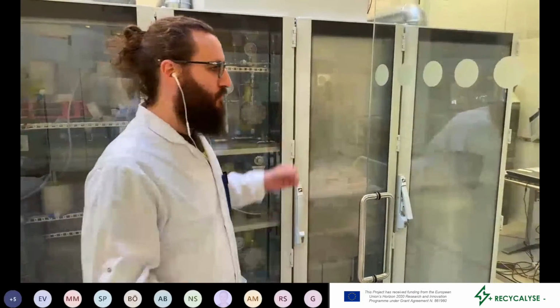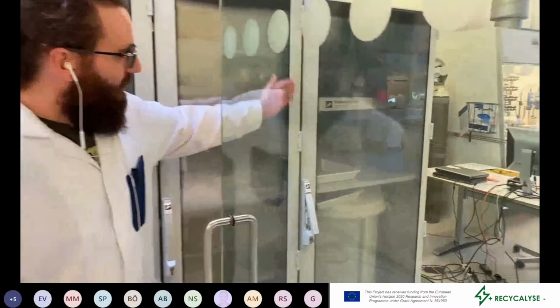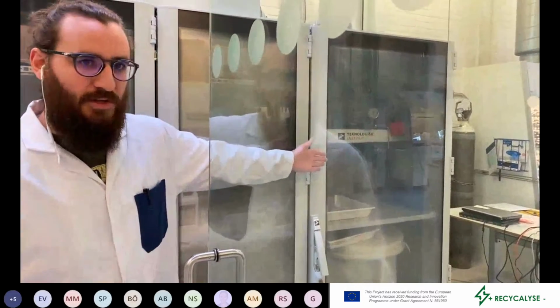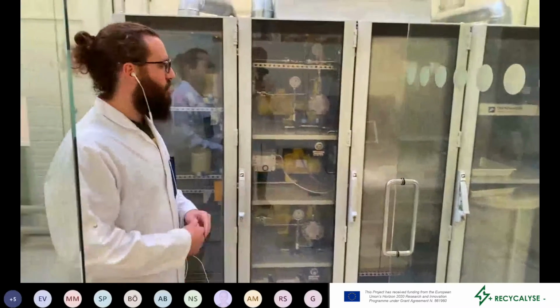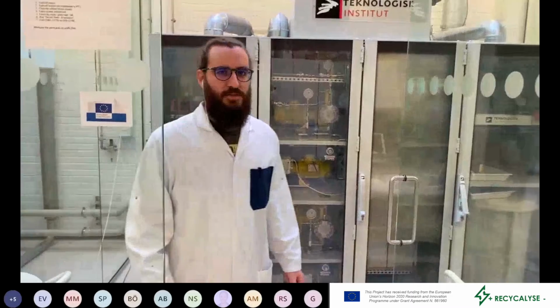So it's basically some tubes where the precursors are mixed. And then in the last part there, we have the tapping section, where we can either tap small amounts of material or up to 100 liters of product. So this is meant to be also used for really large upscaling of this flow production.